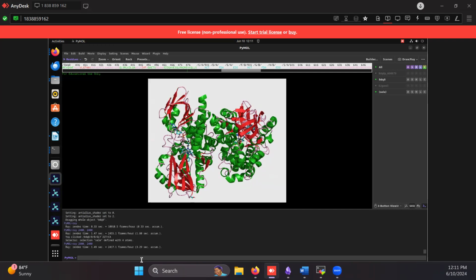If you want to save this image, since it's not saved right now, the option is to say PNG, and then save it. You specify the directory where you want to save it. I know where I'm going to save it, and this is the directory, and then you give it a name. This is the entire directory and location of where you want to save the image.